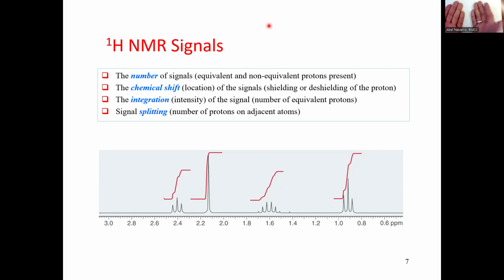So it will cause a signal response on this one. Even though I'm looking at these hydrogens, the magnetic behavior of the neighbor will cause a response on that peak. That's something we cannot avoid. So splitting is a property, and you actually use it to your advantage.